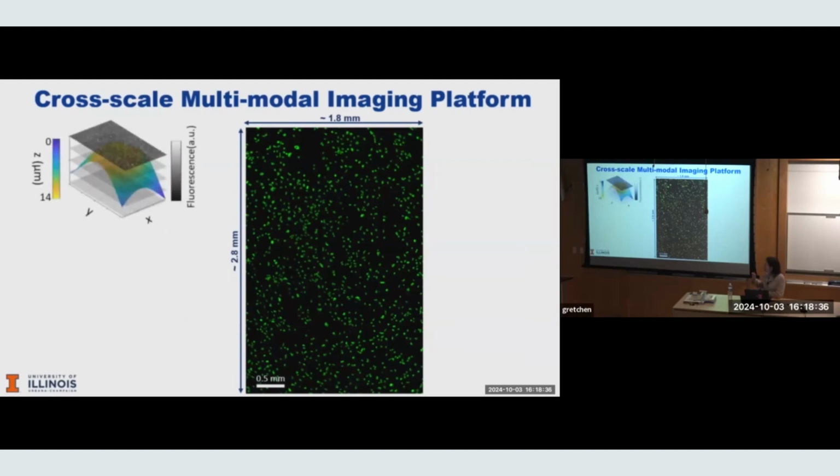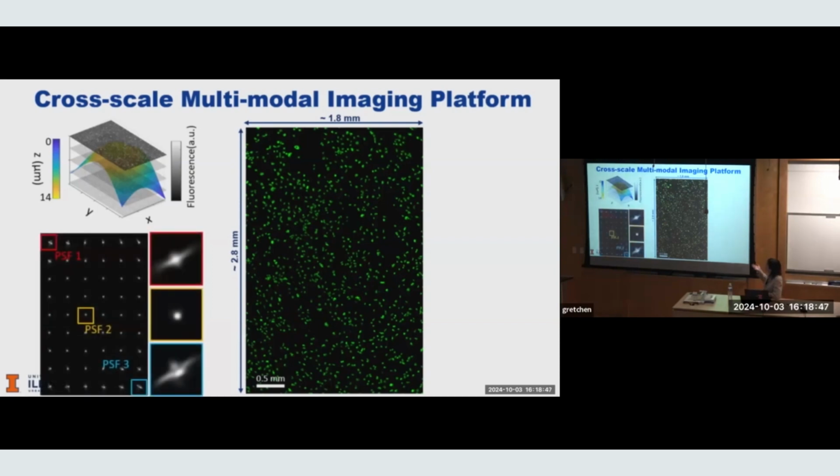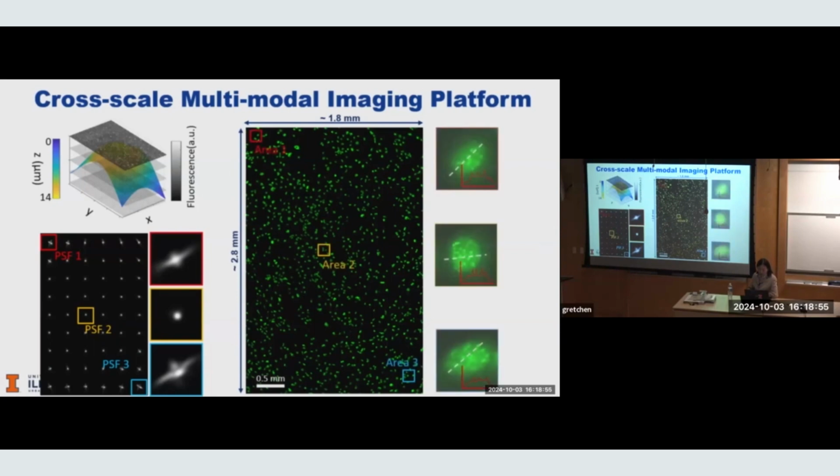You know, one of the issues, I think many of you here probably know this, the field is not that flat. So there's definitely a field curvature aberration, even when everything is focused, because these lenses are not really designed for high resolution microscopy. So you see a lot of aberrations at the corners of those. So that's also reflected in the actual image we see.